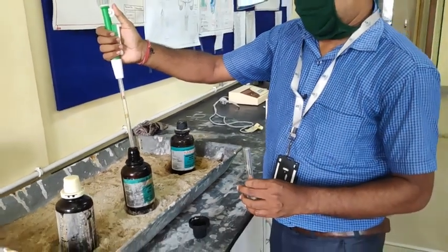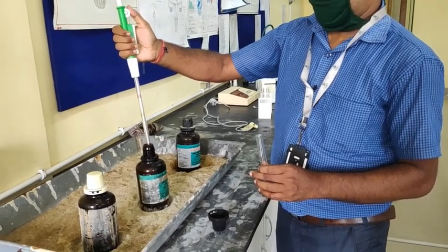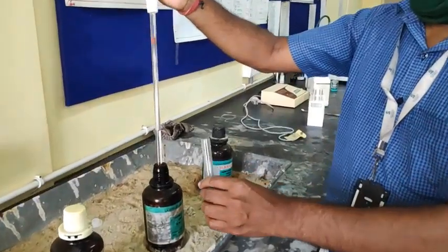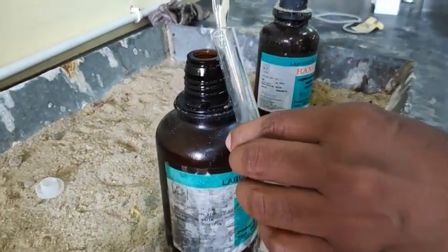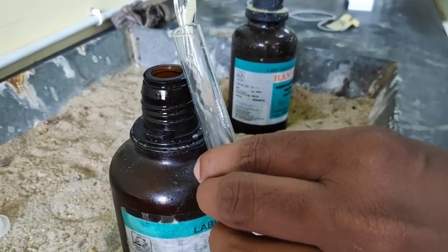Debashish sir is using the dropper system, and he took a few drops of nitric acid, and after that he is adding this directly to the sample. Please note that this sample has to be kept in a slanted test tube.